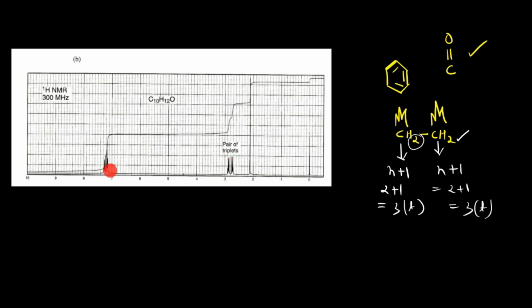And the benzene ring is again there, a very complex splitting pattern, as I have explained in my previous isomer, right? So this again is having the benzene ring, and these are the two triplets and the singlet. And then what can we conclude, what structure may we have? See, one thing is sure, this unit I am having, this unit I am also having, and the third unit I am having, which is this one, right?